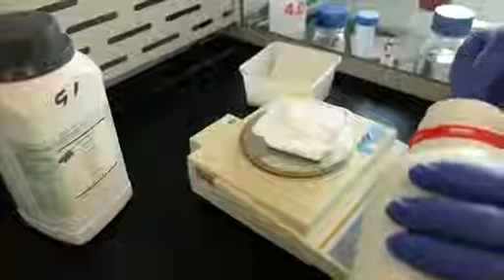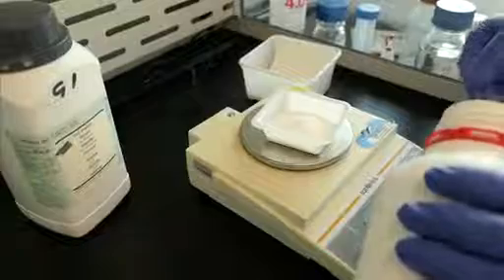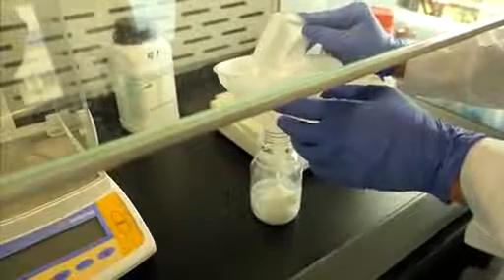A key component of the reaction buffer is polyvinyl alcohol, or PVA. This is dissolved in phosphate buffer at a concentration of 18%. PVA is dusty and toxic when inhaled, so be sure to weigh PVA under a fume hood.